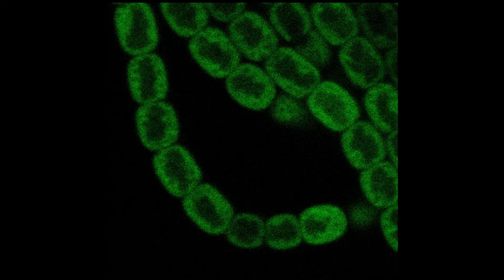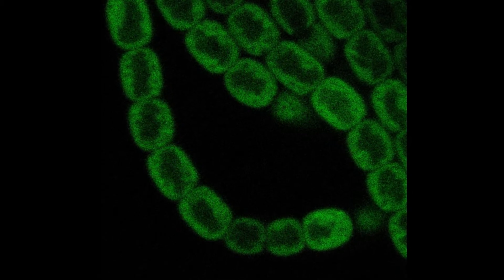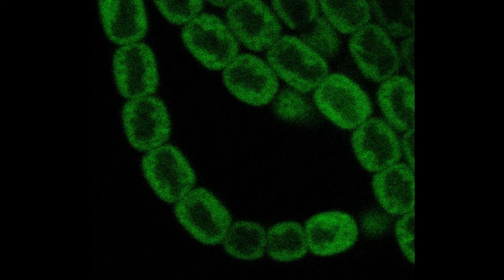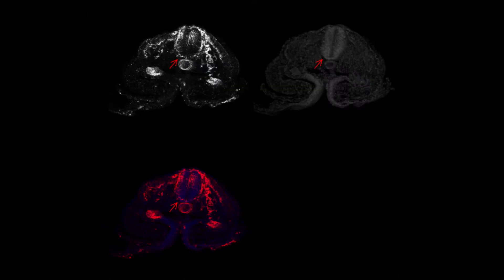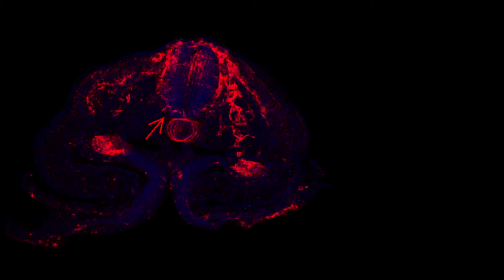This is a micrograph of a cyanobacterium taken by the Summers Lab. The green color is a sigma factor tagged with green fluorescent protein to show protein localization. This is a maximum intensity projection of a section through the trunk region of a chick embryo taken by Chris Walheim and Maria Elena de Ballard. The blue is DAPI staining, and the red represents neural crest cells immunofluorescently labeled with a red fluorophore. Such thick vibratome sections can be scanned along the z-axis without interference from out-of-focus light, only with a confocal microscope.